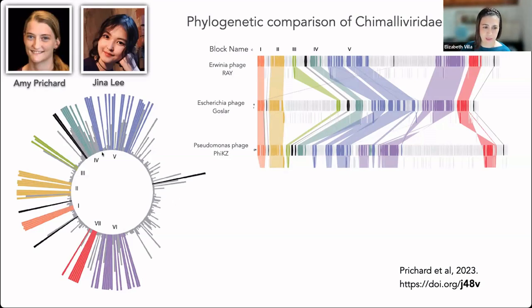But what's stunning about this image, of course, is that phage are normally super tightly packed and every protein is essential. People have tried to repurpose phage as tools for other things, but it's really hard to do because you can't really take anything out. They've evolved to be a lean, mean killing machine. But here we can see that there's a lot of dead weight, and it's only about 70 out of 300 to 400 genes that are needed.